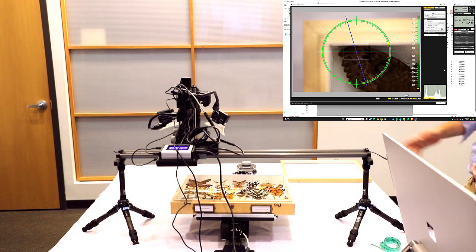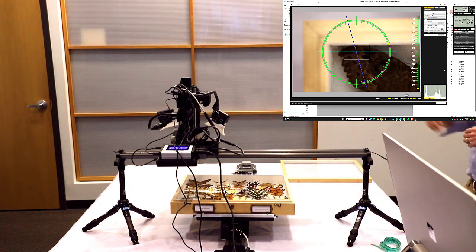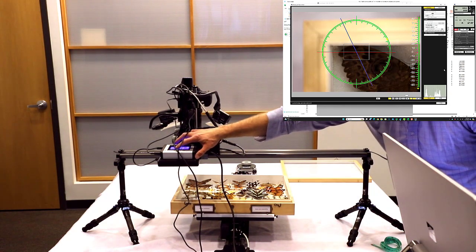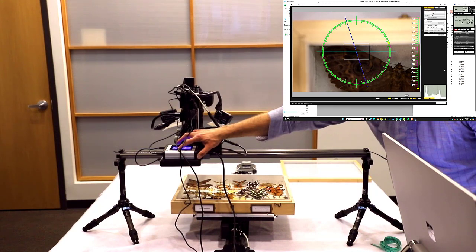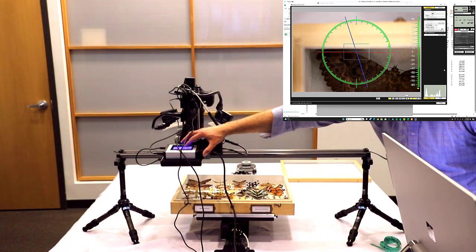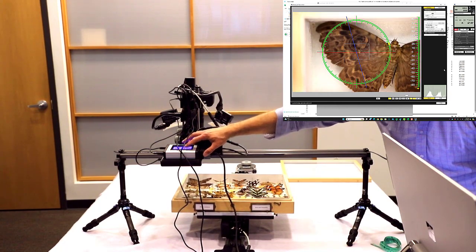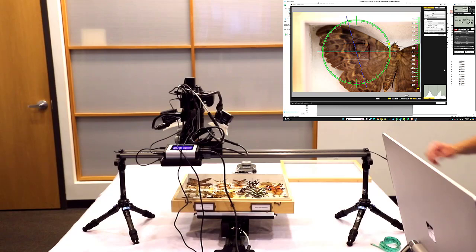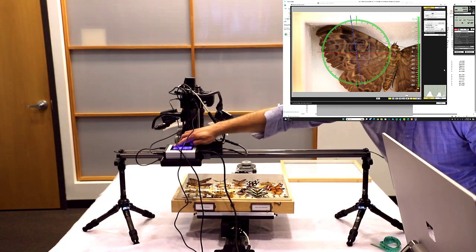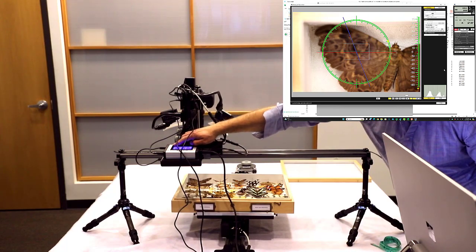Okay, so now, once we have our camera pinpointed, you can see that we're a little bit off and extended past the box. So I'm going to press the y-axis to bring us a little closer to the starting point. Z-axis, we're going to bring the box up to bring us again a little closer to our starting point. And now we're going to use the X-axis button to bring us down to the very bottom of the box where the foam is.